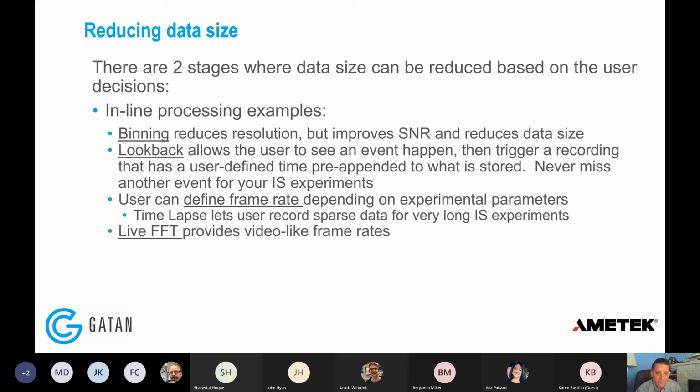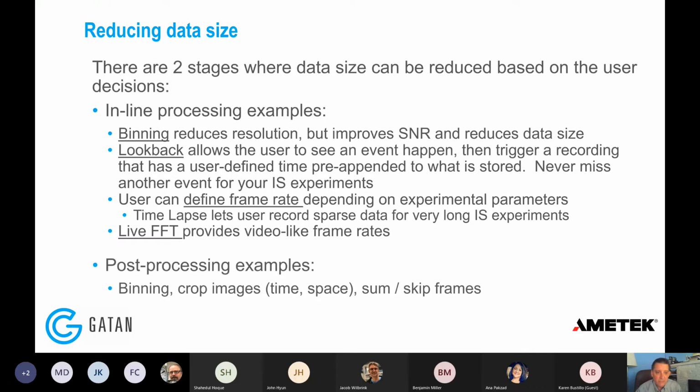The other one is live FFT, which isn't directly related to data size, but because we provide a nice video-like frame rate for live FFTs, you can get a lot of information about your material samples just looking at the FFT. Many times that tells you if you're in a good area or bad area, whether you have the alignment you want, whether you're seeing the reaction you want. That's an extremely useful tool that a lot of people maybe overlook. But that's our primary line of defense, I would say.